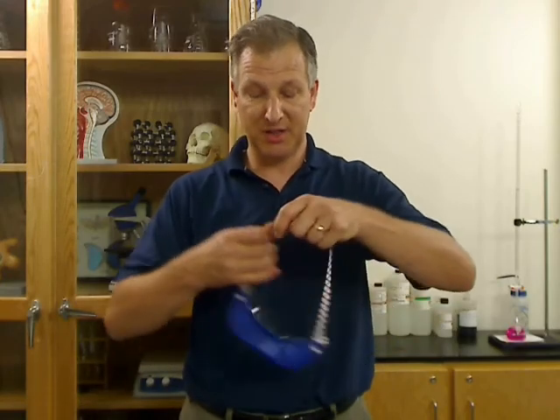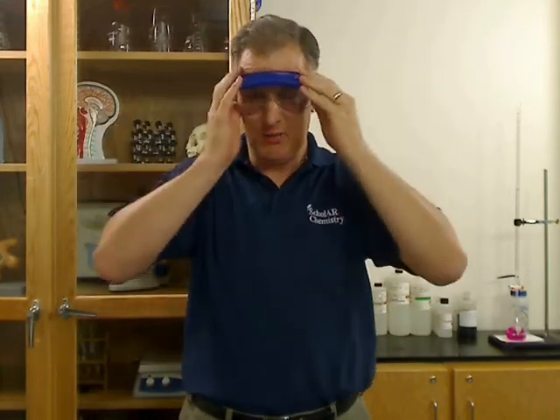Safety for this lab is fairly simple. We're going to be using corrosive materials. Most of them will be very dilute, but we still have to wear our safety goggles during this activity. And depending on your lab rules, you may also be wearing gloves and an apron.